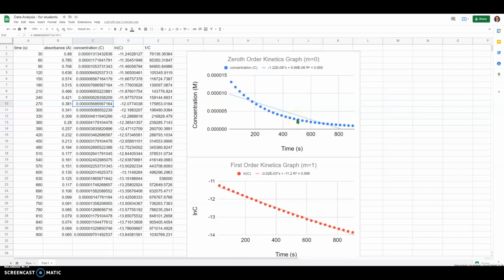We need to do the exact same thing for trial 2. So let me show you another shortcut to make your life a little bit easier here. Because I've got everything done for trial 1 in this sheet, I'm going to go ahead and duplicate this sheet and then call this next one trial 2. Now, everything looks exactly the same right now. If I switch back and forth, right, you can't tell any difference here between these two sheets.